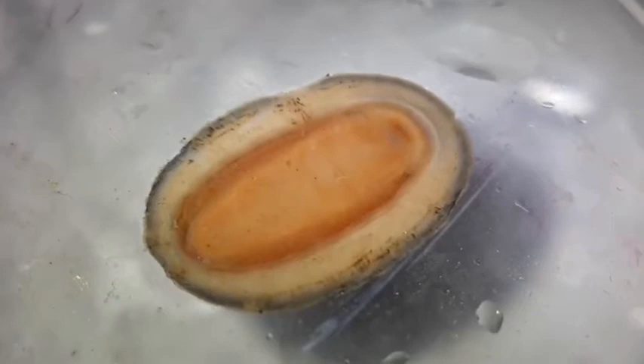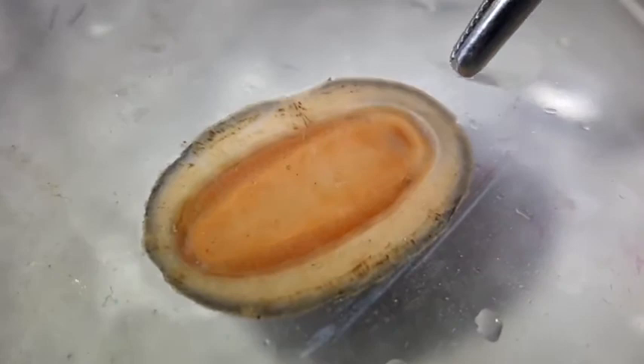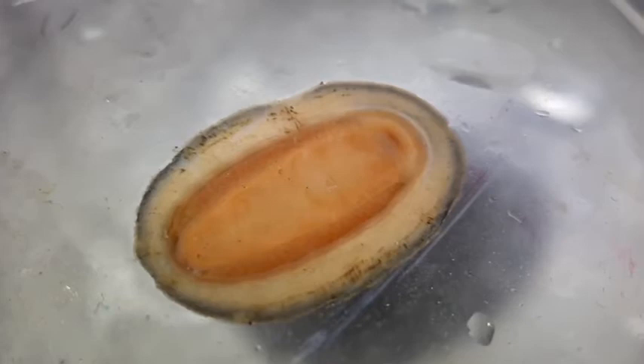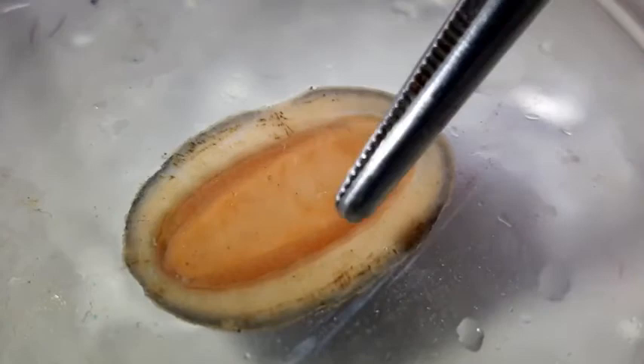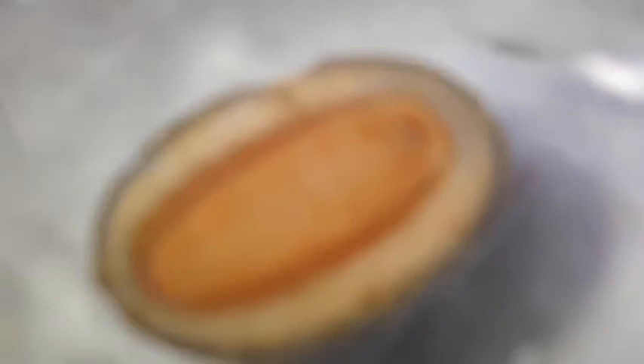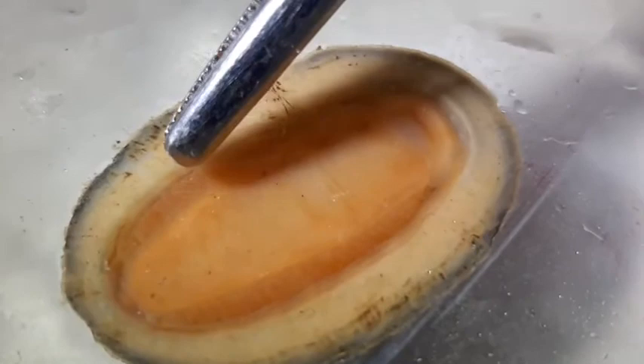The first thing we'll talk about is the outer edges right here, which is the girdle that we saw before with tiny scales on top. As you can see, that's completely soft tissue underneath. Right next to the girdle, you have these dark filamentous parts — you might already be able to guess what they are. These are the gills. A lot of gills will be in this kind of feathery and dark structure that you see right here. The gills themselves are placed in the mantle cavity, which is this little channel that runs all around.